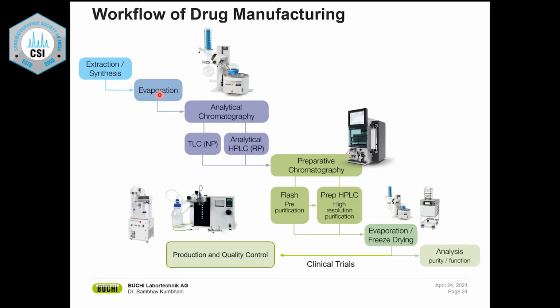Buchi also offers one of these lyophilizers for this purpose only, for freeze drying your sample. And I'll also explain how that works in a minute.